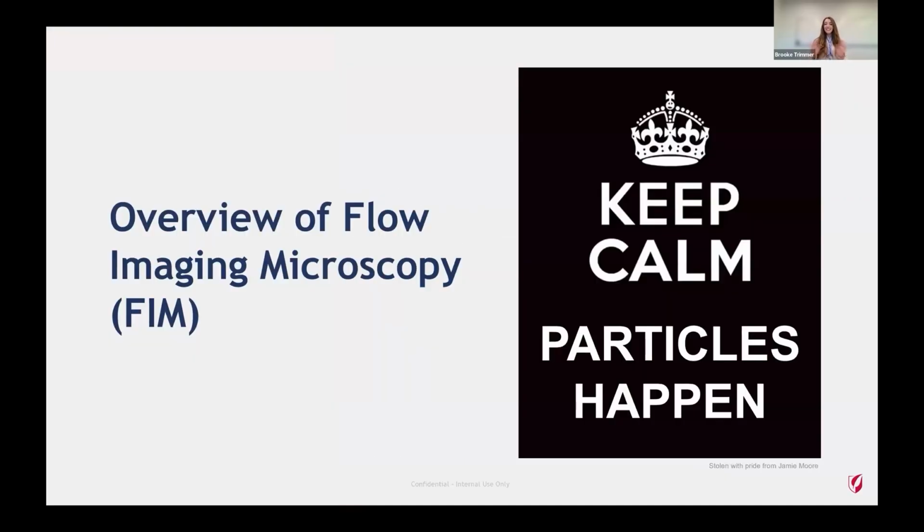So to start, I love this. This is from Jamie Moore. This is kind of her iconic slide here with "Keep calm, particles happen," right? If you're here, you probably have to do some sort of work with particles and particulate matter analysis. So, flow imaging has been a really wonderful tool in helping us to do this sort of characterization.